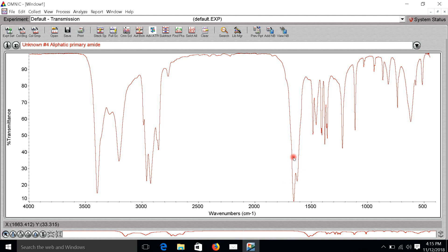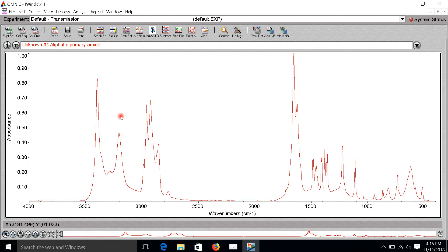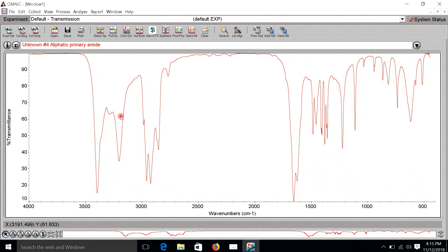Hello, today I will show you how to convert the spectrum into a GSV file. First, we have to consider the type of spectrum. This one is a transmittance spectrum — I can convert it to absorbance or back to transmittance.